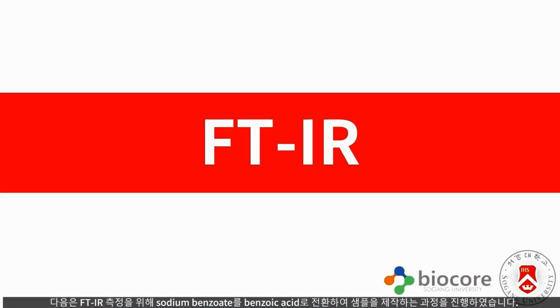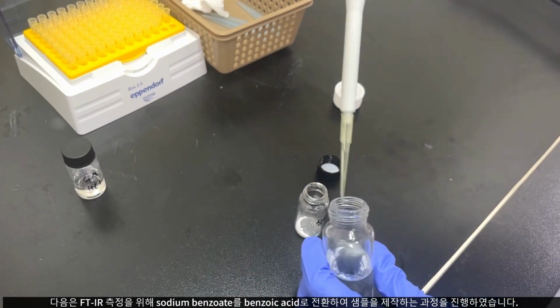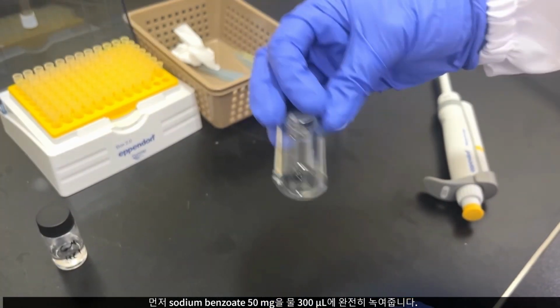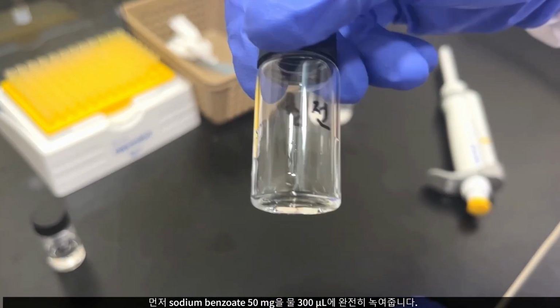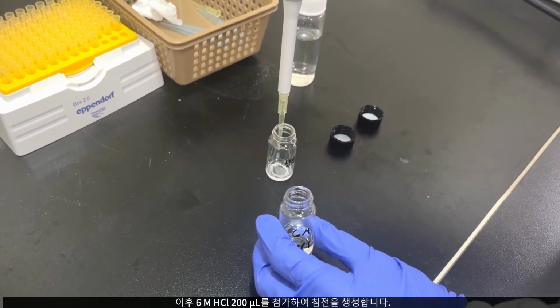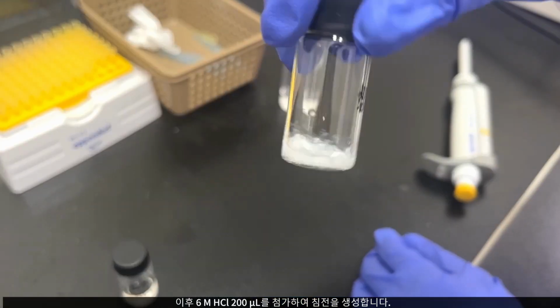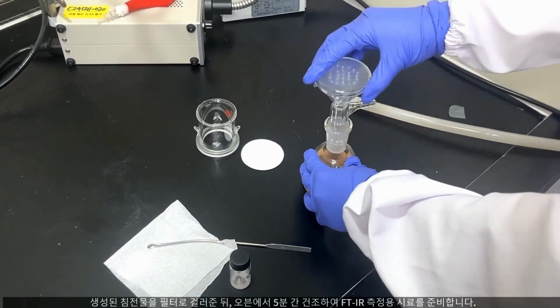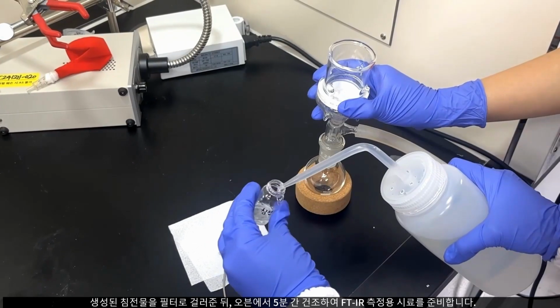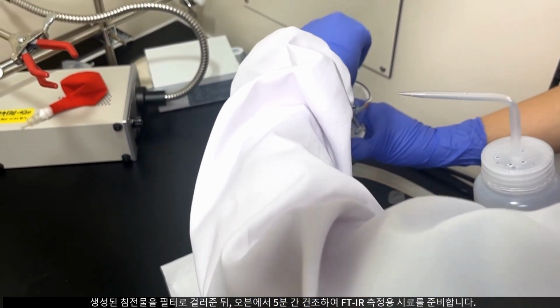Next, for the FTIR measurement, we prepared a sample by converting sodium benzoate into benzoic acid. First, 50 milligrams of sodium benzoate was completely dissolved in 300 microliters of water. Then, 200 microliters of 6 molar hydrochloric acid was added to generate a precipitate. The resulting precipitate was collected by filtration and dried in an oven for 5 minutes to prepare the sample for FTIR measurement.